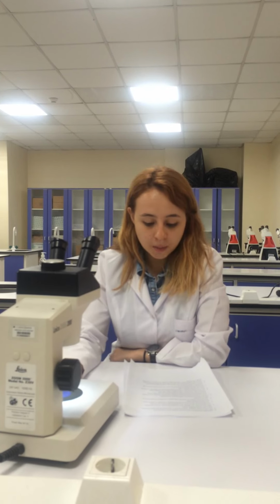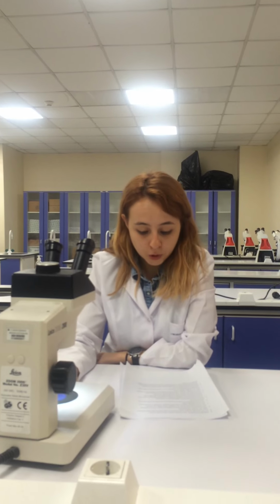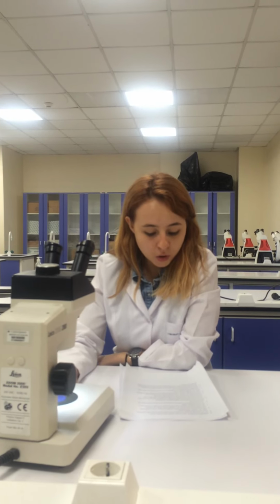After 2 washes, the pellet is embedded in OCT compound and sectioned with a cryostat at a thickness of 5 micrometers. Slides of cryostat sections are stained with toluidine blue O solution. The toluidine blue O solution is removed and the section is washed twice with double distilled water. Chondrocytes on slides are ready for observation by light microscopy.